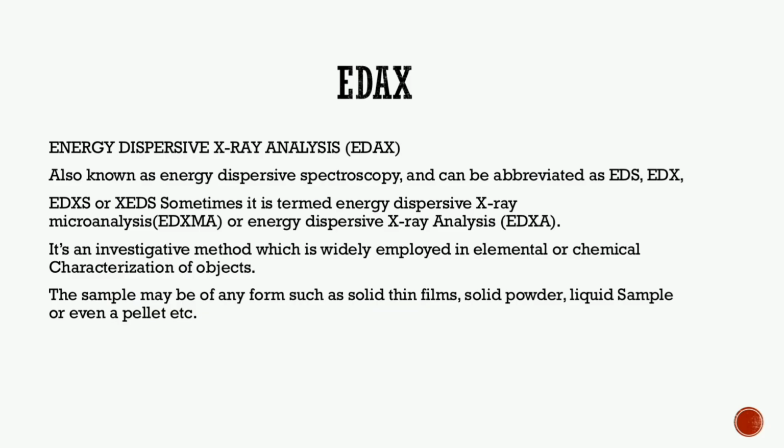Next we are going to discuss EDAX. The technique EDAX is the abbreviated form of energy dispersive X-ray analysis. It is also known as energy dispersive spectroscopy, abbreviated as EDS or EDX. Sometimes it is termed energy dispersive X-ray microanalysis. This is an investigative method which is widely employed in elemental or chemical characterization of objects. Here, the sample may be in the form of a solid thin film, solid powder, liquid sample or even a pellet.